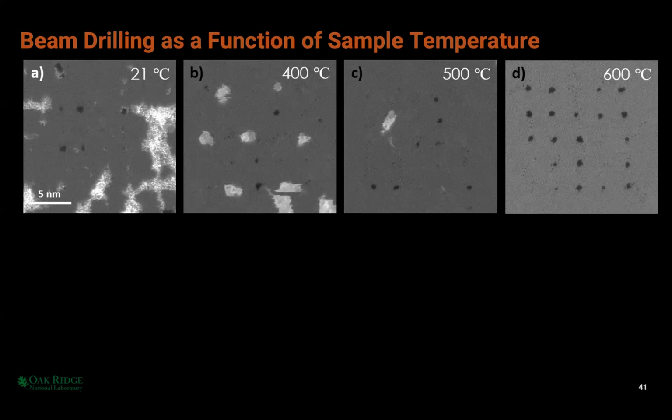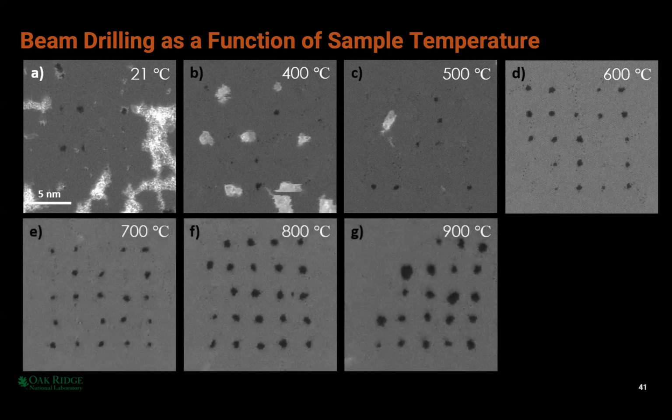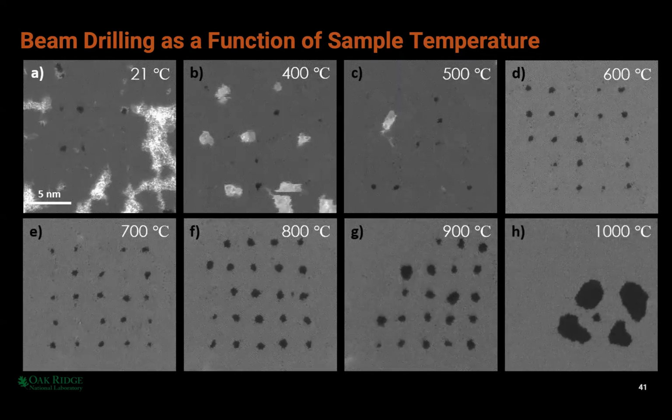Around 600 C, we started getting more and more reliable, but still not perfect. And then we get to 900 C, and first of all, it takes forever to drill a hole. And then we go even hotter, and we just can't drill a hole, right? It's the weirdest thing, because we expected a higher temperature for the atoms to have more energy, so it just needs less of a kick to actually knock it out of the lattice. That was our anticipated result. That was our hypothesis, right? But it didn't prove out to be true.